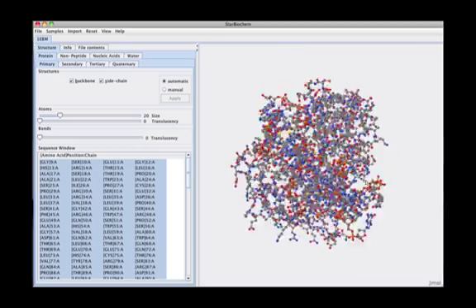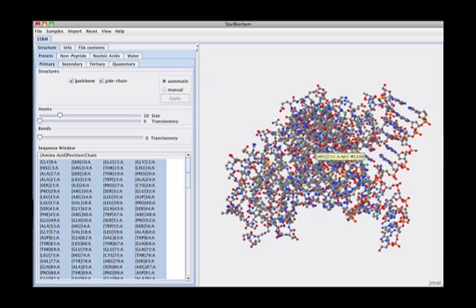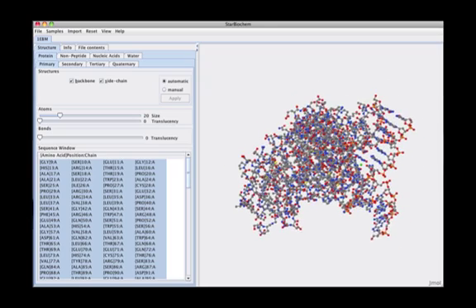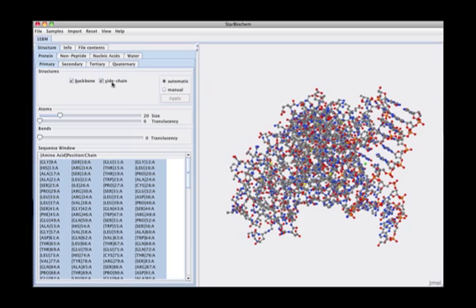Unlike conventional protein viewers, the star biochem user interface visually represents protein structural information based on the four levels of protein structure. Items within the structure can be intuitively manipulated by a set of buttons and sliders.